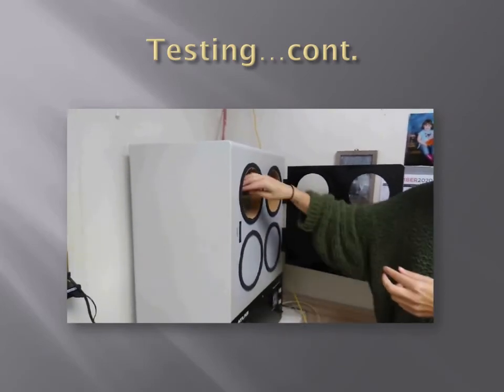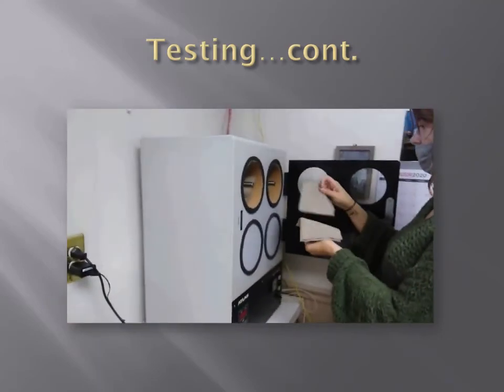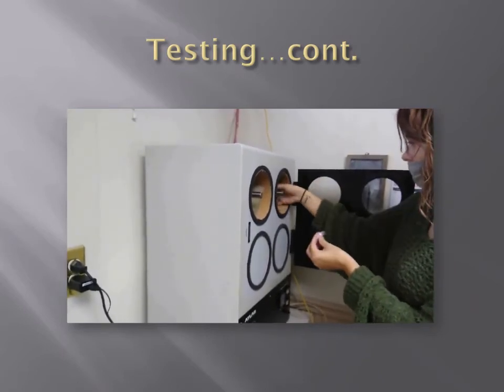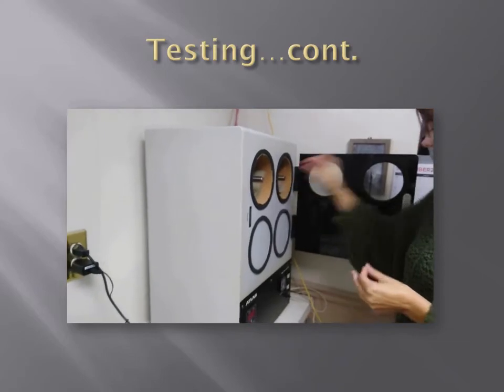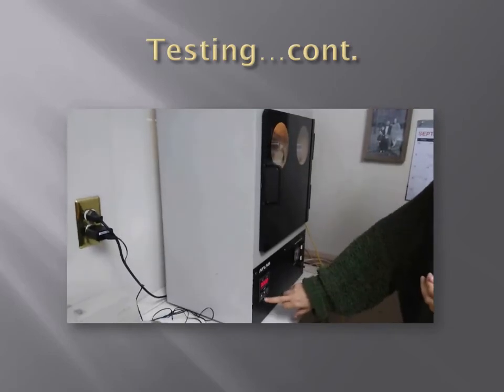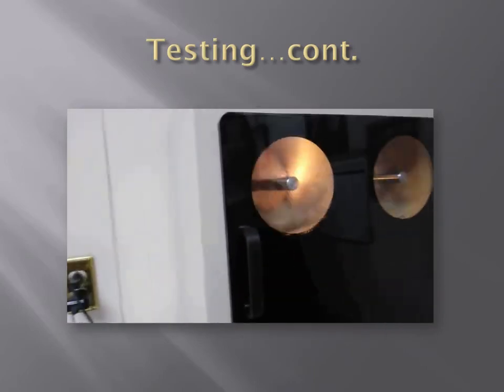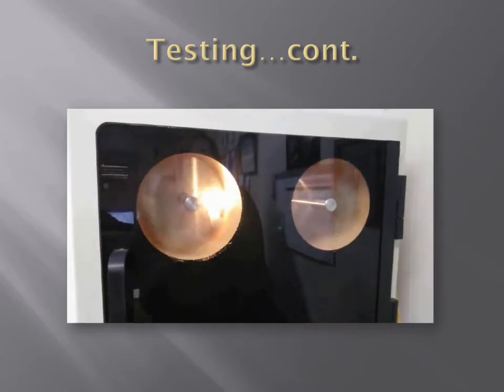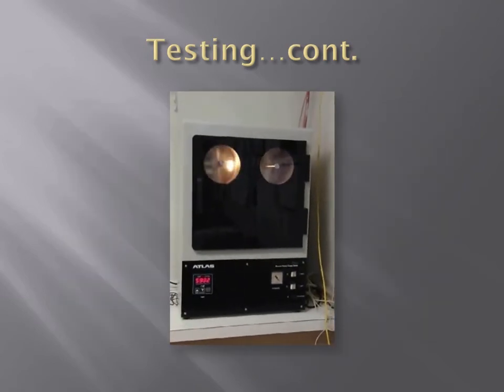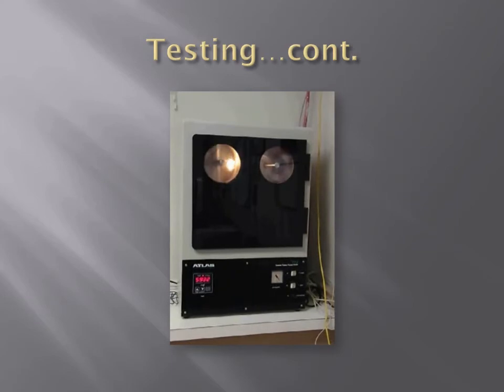Here we have our lab technician loading the specimens into the testing chamber with the tiny amounts of sliver. Once loaded, the machine is powered on, the light is turned on, and the air injection is switched on, and the time is set. The start switch is then activated to begin the test. The 3 swatches tumble in the chambers, tossed around violently by the metal impellers and compressed air to simulate friction caused by wash and wear.